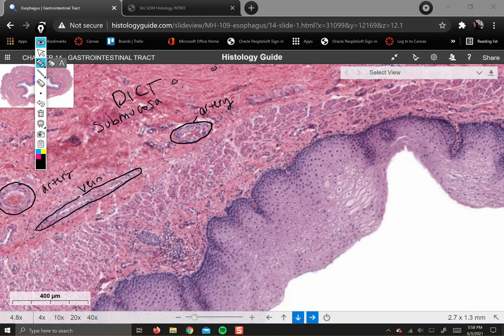So it's not entirely longitudinal, which is what students tend to look for, those long spindle-shaped cells, and it's not always going to be. So what I'm noticing is it's a little bit more purple than the very, very pinkish red, dense, irregular connective tissue, and I can see that the groups of muscle cells are separated from each other, but overall it definitely gives the appearance of being smooth muscle. So again, practice, practice, practice. The more smooth muscle examples you see, the better you will become at identifying it.